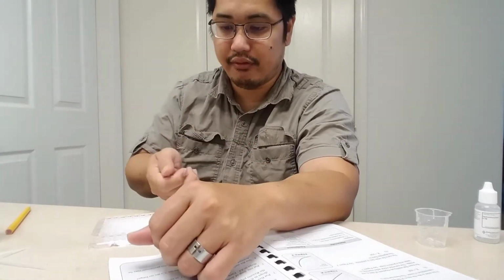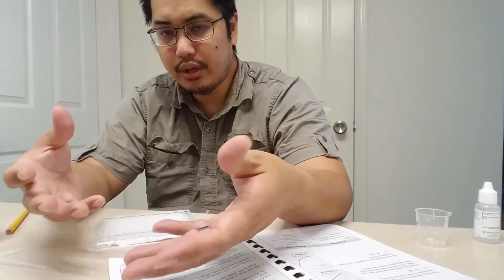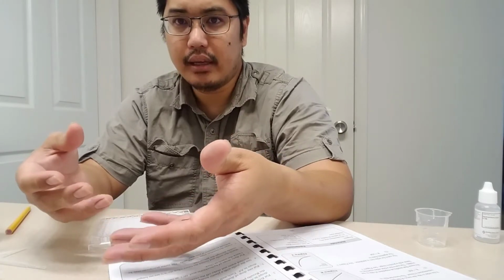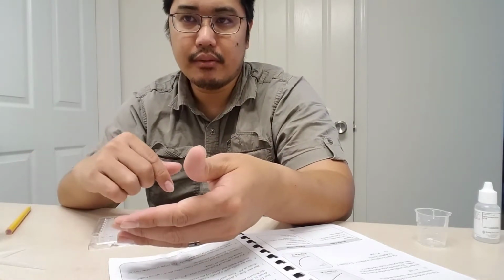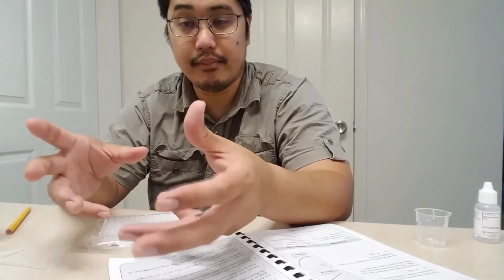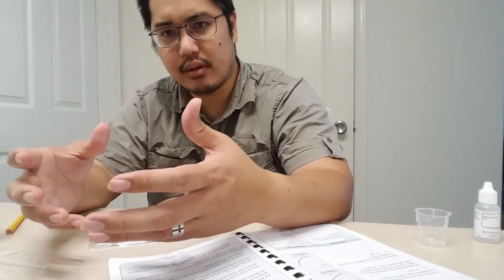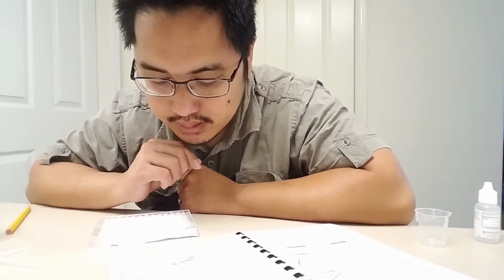Imagine if I took a little fire and I heated these things up. Maybe that might cause the reaction to go faster or slower. We don't know. And we don't want to say the reaction rate depends on both the concentration and also maybe the temperature and also how much you shake it. We want to investigate each of those variables one at a time. Yeah, I can start seeing a difference here.